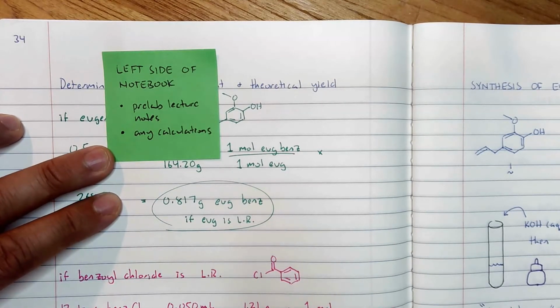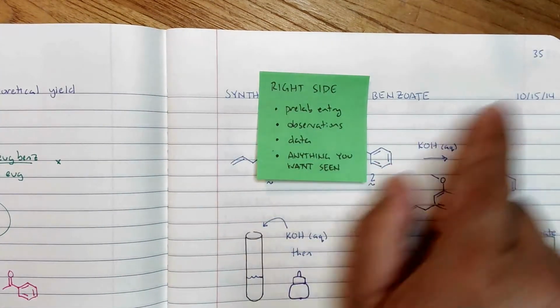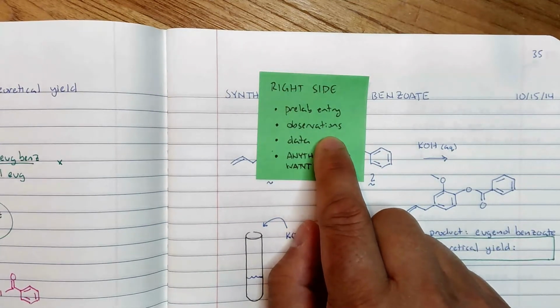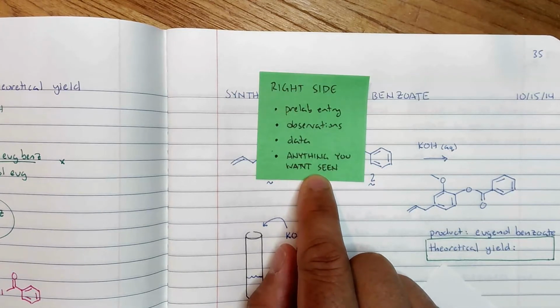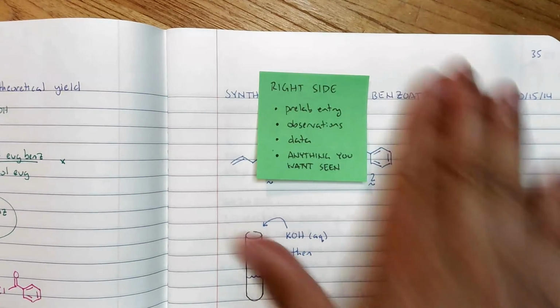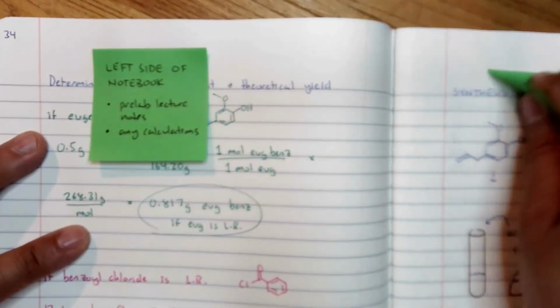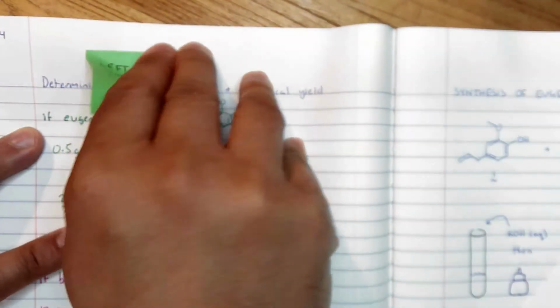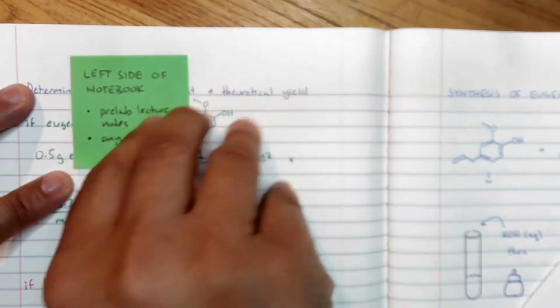So what is on the right side? Well, we started the pre-lab entry on the right side, the odd numbered pages. Observations, definitely I want to see. Data, I want to see. So anything that the instructor wants to see, I would put on the right side of the notebook. Any other supplemental notes or calculations that are not necessarily important for the instructor to see is on the left side.